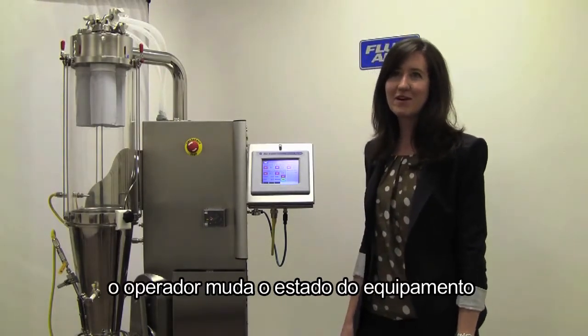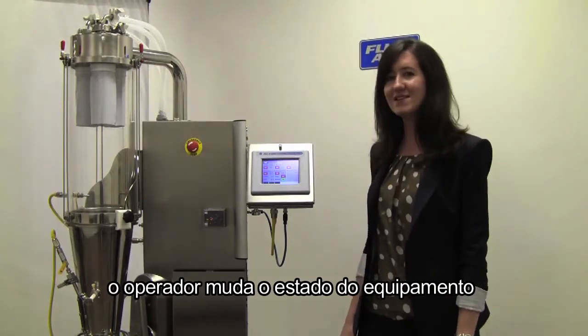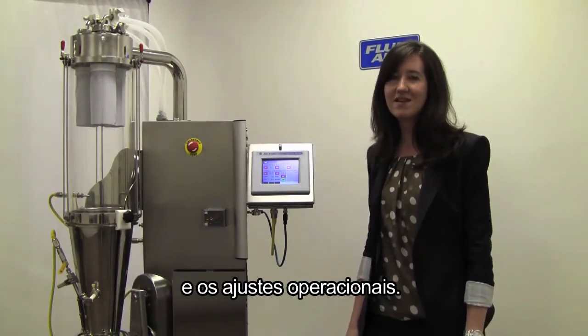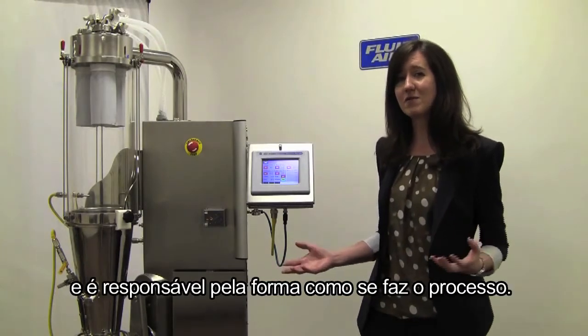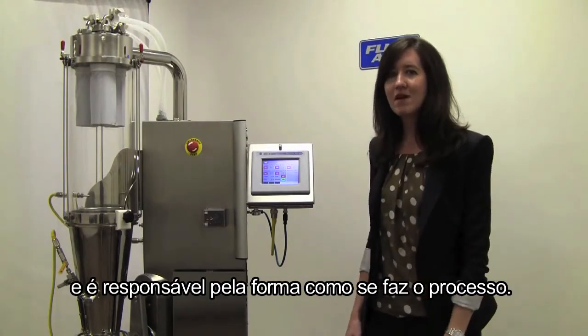Using manual control, the operator changes the equipment states and operating set points. Using that mode, the operator has full control over the system and is responsible for how the process proceeds.